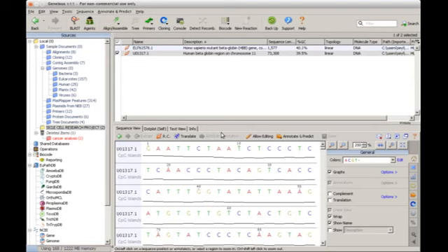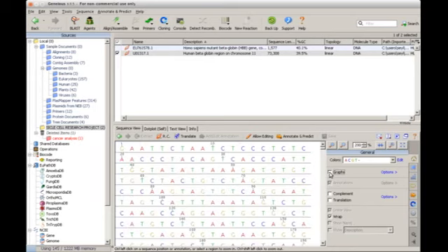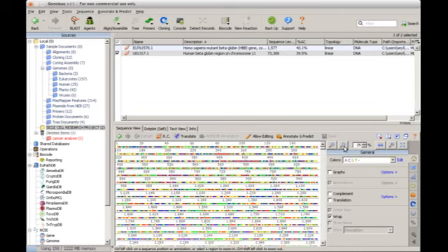The next thing you move on to is understand the graph. This is the option for graph. If you click it, you can remove it, and you have your full intact sequence without any gap.